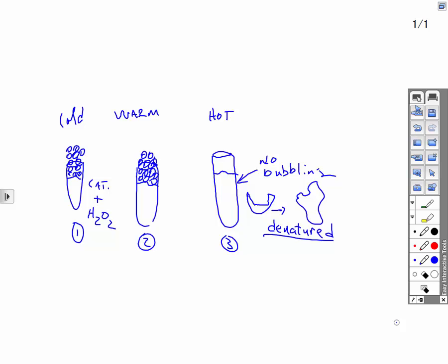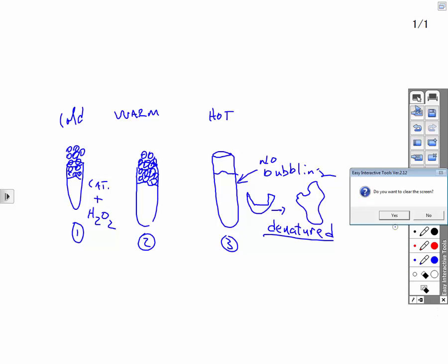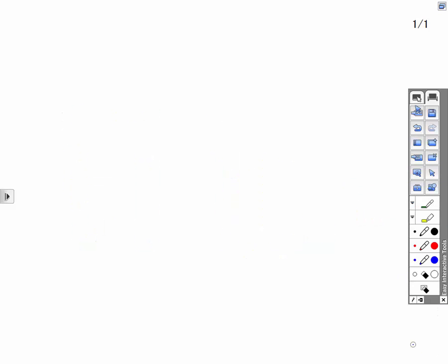The other experiment you're working on is catalase in different concentrations. If you'll notice in tube 1, it says you have 1 centimeter, and mark the tube at 1 centimeter and 5 centimeters. At the first mark, you'll put water. At the second mark, you put hydrogen peroxide. Once again, catalase will break down hydrogen peroxide, but water will not. So tube 1 is going to be your control. Nothing at all should happen with that one.